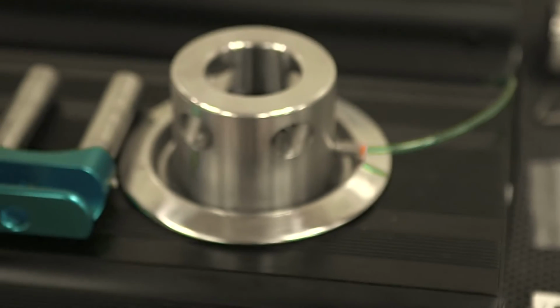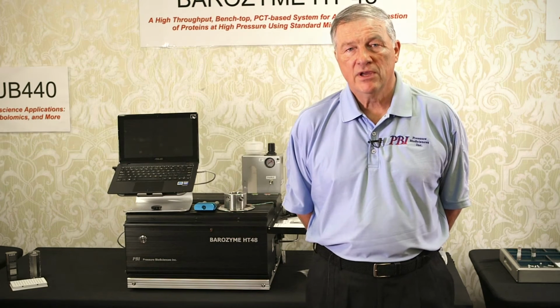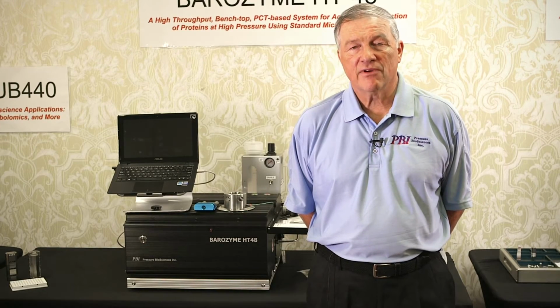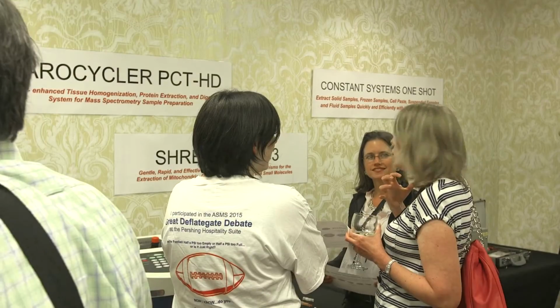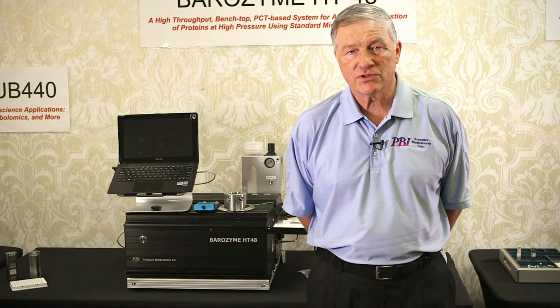When you use the squeezing technique of applying pressure on and off, you're able to sometimes get more things out of a cell than you have using the methods that we've been using for about 50 years. And more importantly, you're able to control the process. And the data that are being generated are now showing us that certain things happen faster, happen better, happen more reproducibly when you do it under pressure. So we've begun to develop instruments and bring these instruments into the laboratory for research scientists.